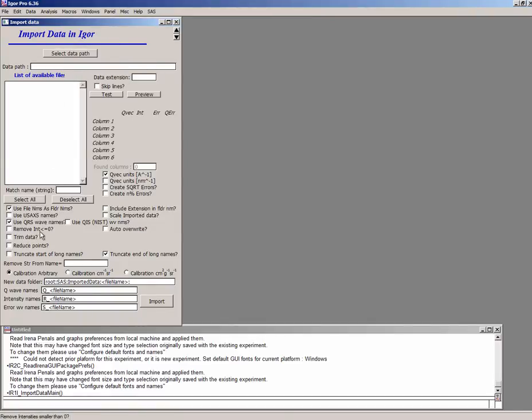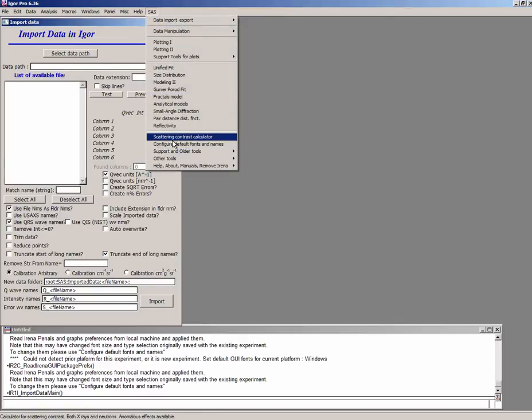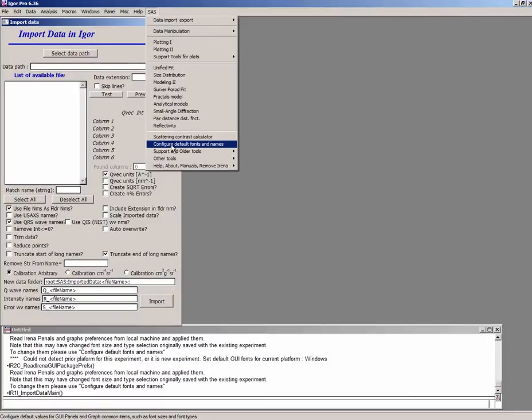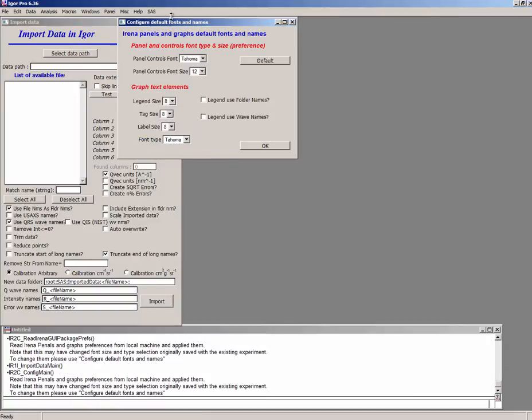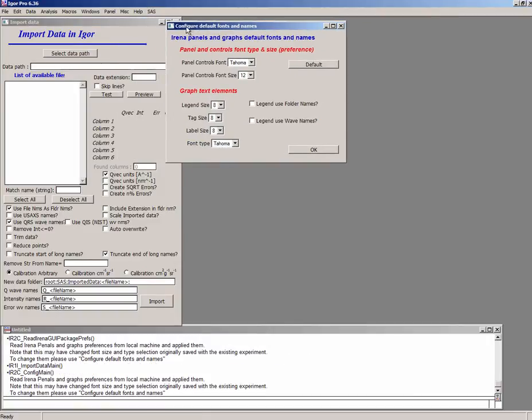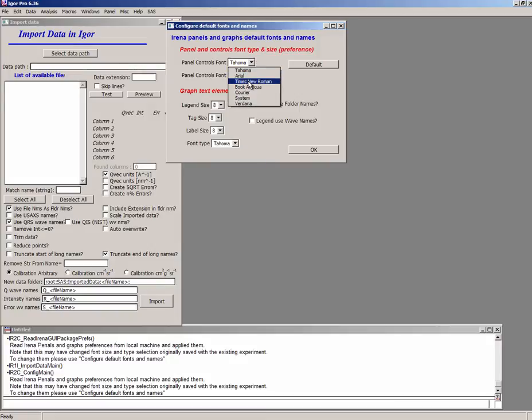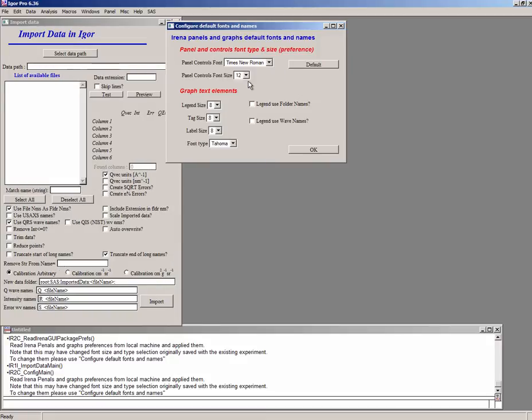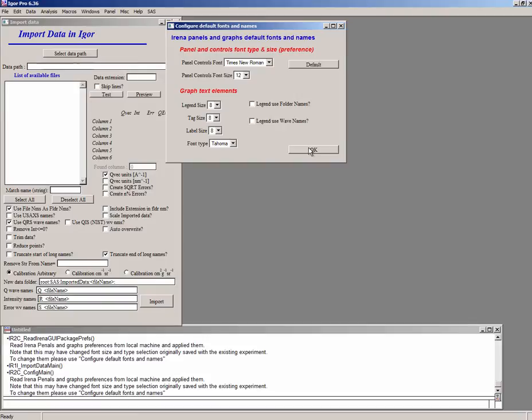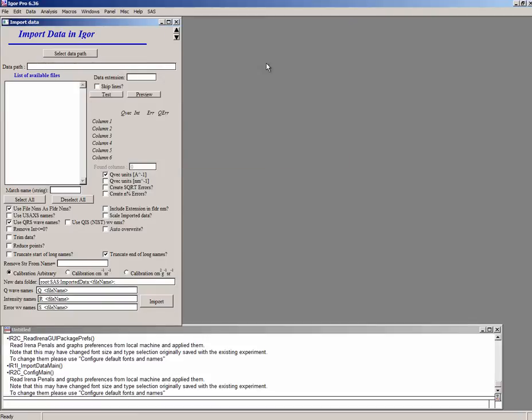Now in case you don't necessarily like the font sizes, if you feel the font doesn't look too good, you can first optimize the graphical interface. So you can go in and set and configure default font and names and you can pick, for example, you would like to have a smaller font like Times New Roman which makes it a little bit easier to read. You can change the font sizes and so on. So now if we have a GUI graphical interface which is useful.